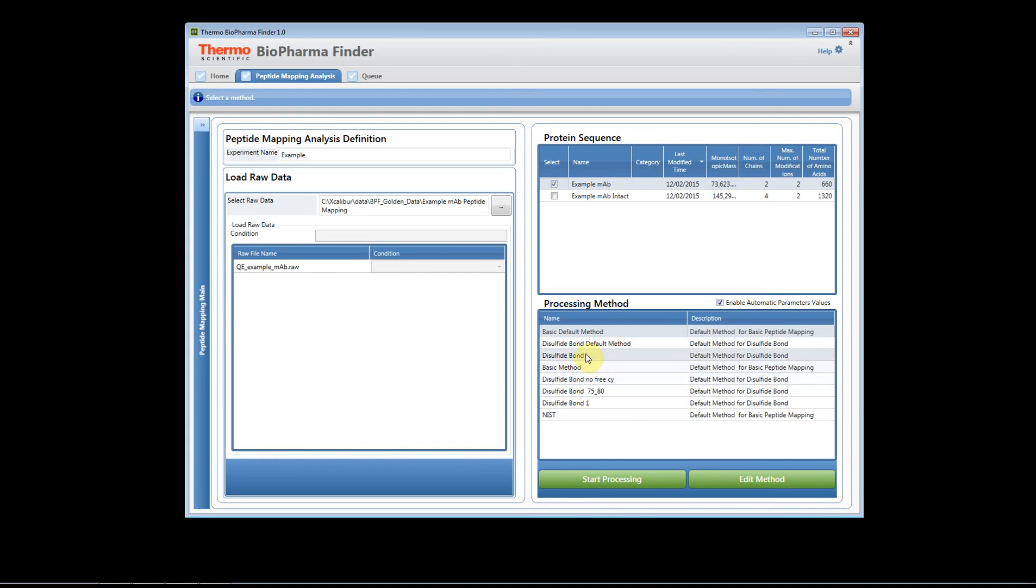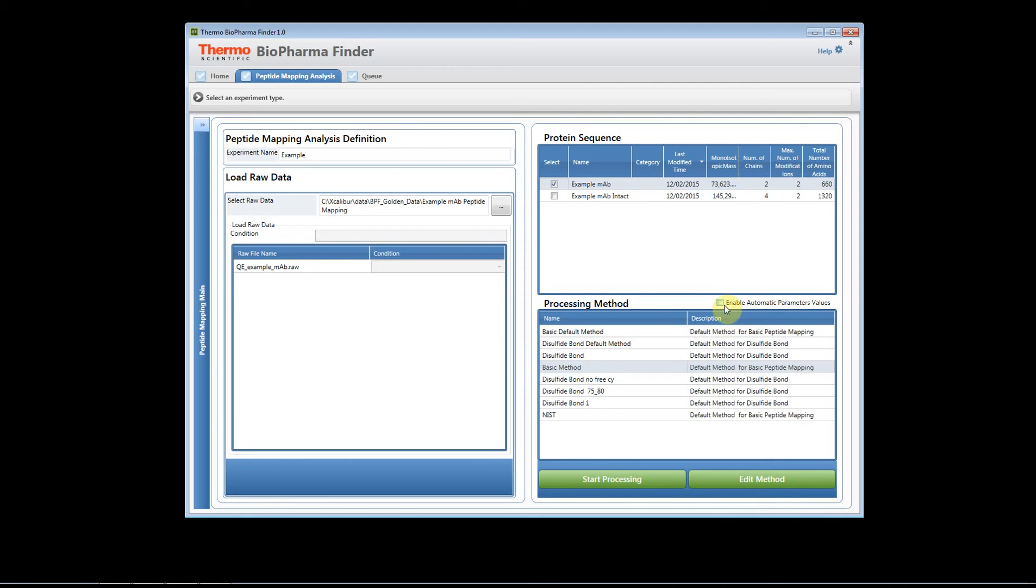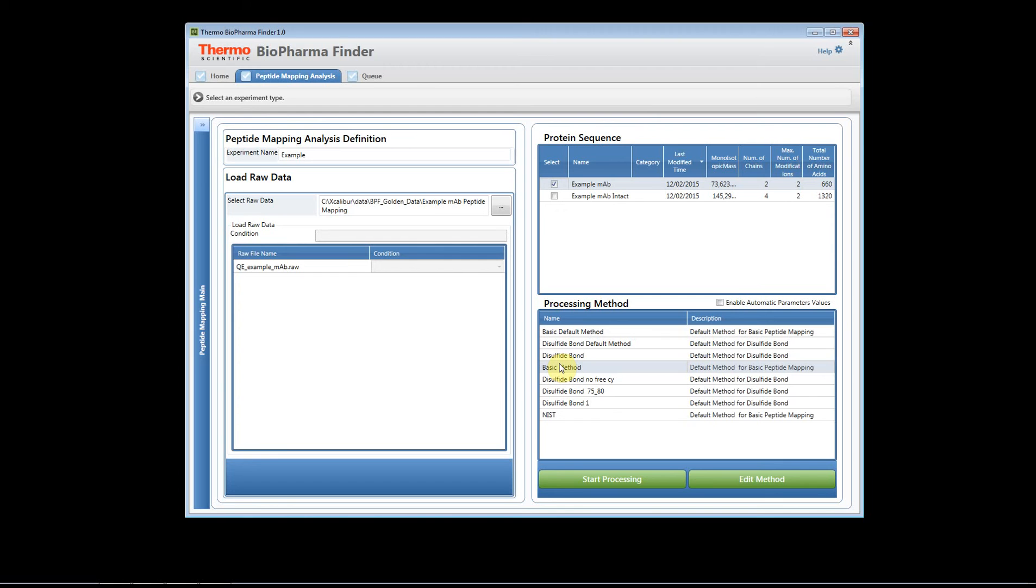What you do then is you select the method that you saved and you uncheck this box. When you uncheck this box and you hit start processing it's going to use all of the parameters that you've saved, so it's kind of like a way to enable a template method to be applied to your data set that you're interested in processing and it won't adjust any of the threshold values or the peak parameters for doing peak widths and identifying the maximum peak width and the minimum peak width.